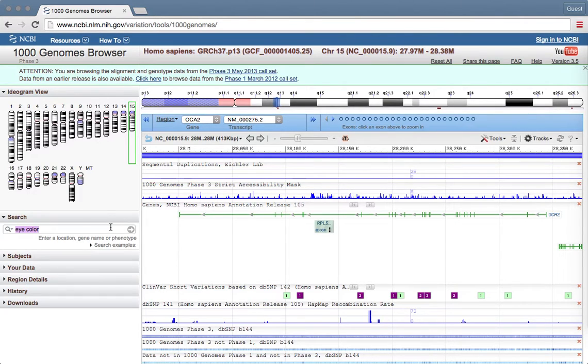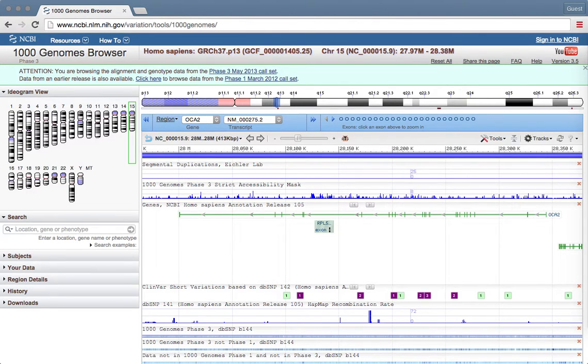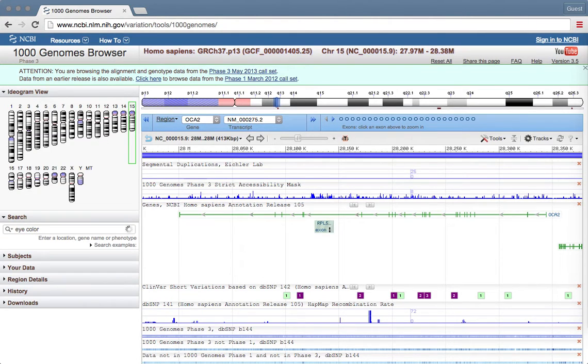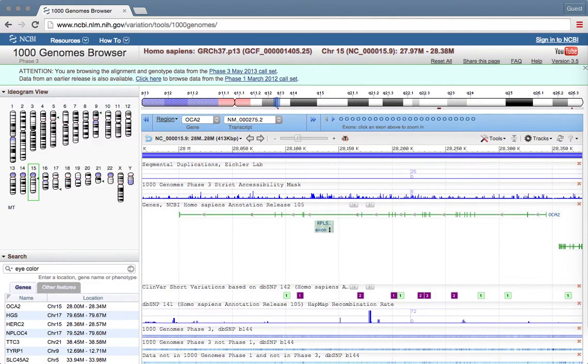The way this works is it allows us to search for a gene that we are interested in. If I wanted to know what genes help determine my eye color, I could search eye color in this box, hit enter, and it will show me the genes.